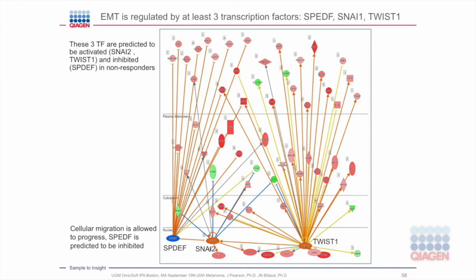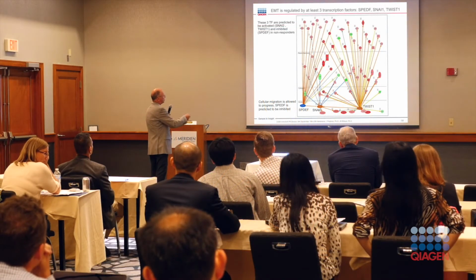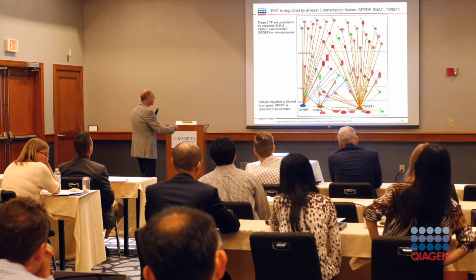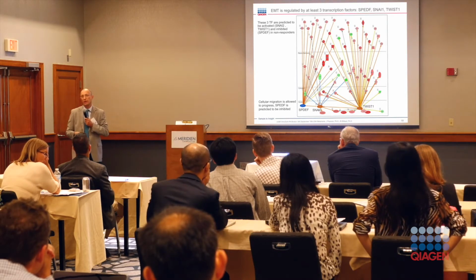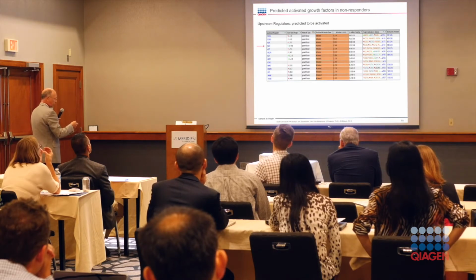So here, everything is telling me that that program pushed the cells to detach from each other and to migrate. And you will recognize many of them. This is a typical hypothesis. These are the real expression in your data set, and these are predictions. Well, you can test that in the lab and validate. If it's good, that's a good hypothesis to have run.